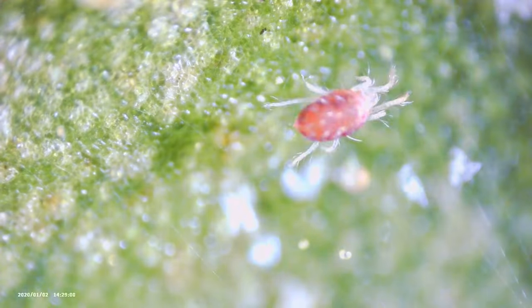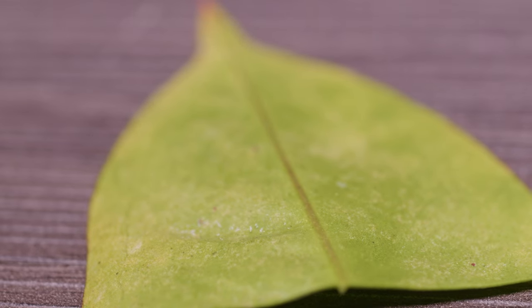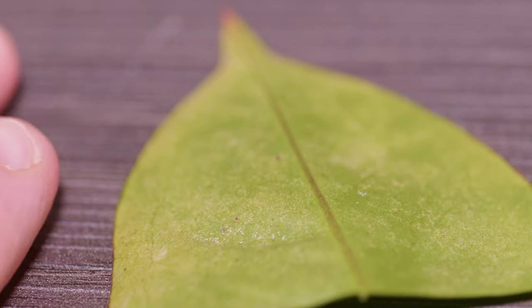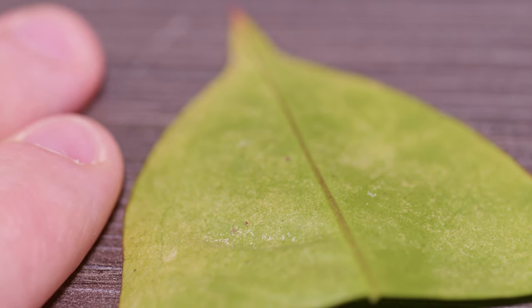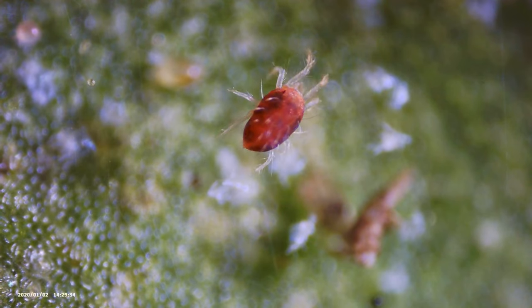The first one we're going to start off with is the spider mite, specifically the red variety. I really hate these guys, but this is what they're going to look like on most plants when you see them. Here is a small infestation — there's really only three or four on this leaf — but this is what they look like from afar. Almost every pest we're going to look at today is pretty hard to identify from far away.